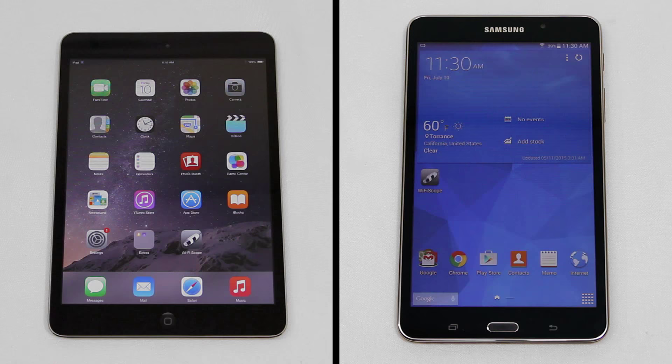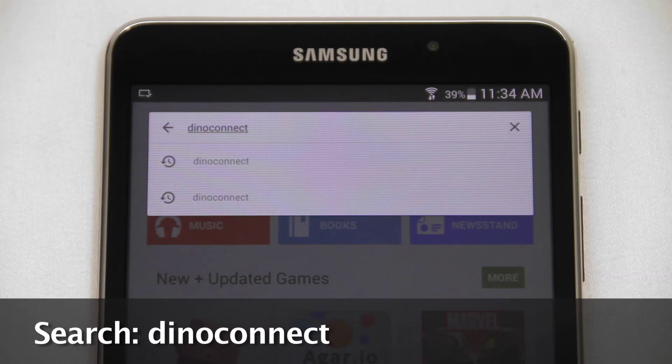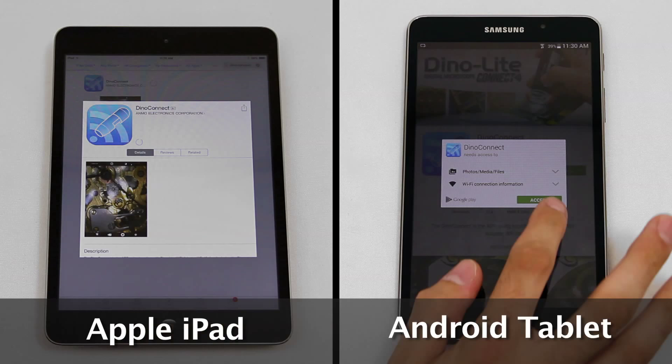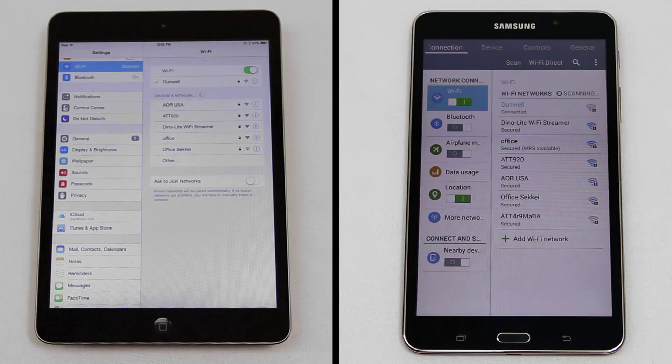The WF10 uses our free downloadable software DinoConnect, found on Google Play or the Apple App Store. Once the app is downloaded, open the Apple or Android settings and navigate to the Wi-Fi section. Select the Dino-Lite Wi-Fi streamer.